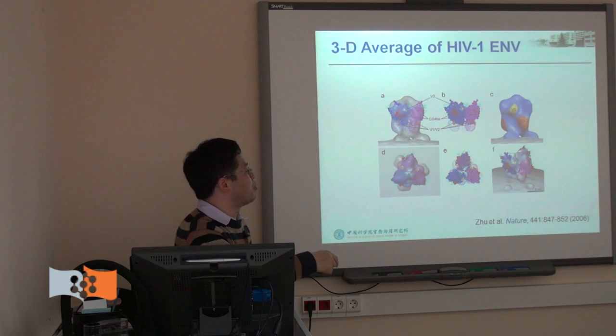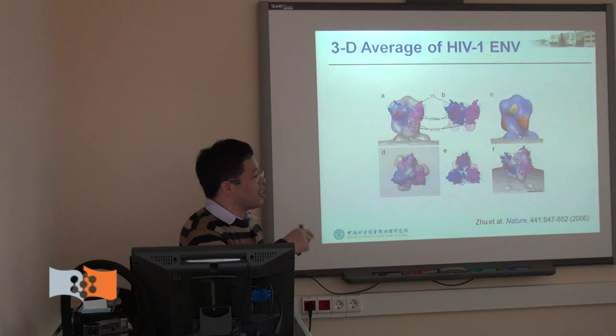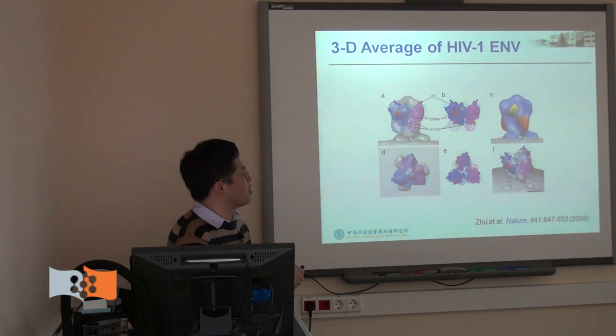But this is still a rough model. The resolution is worse than 3 nanometers, so we cannot see a lot of details here.